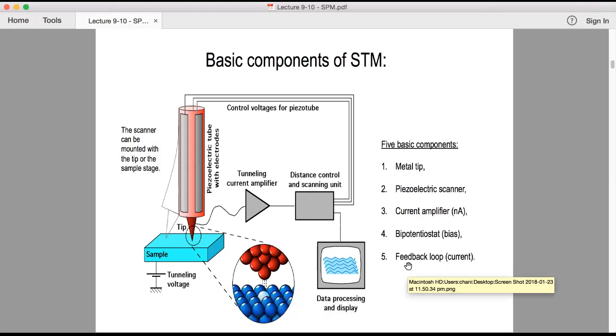The scanning probe microscope has a sharp probe tip on the end of a cantilever, which can scan the surface of the specimen. The tip moves back and forth in a very controlled manner, and it is possible to move the probe atom by atom. Force deflects the cantilever when the tip gets closer to the surface of the sample, and it can be measured by a laser reflected from the cantilever into photodiodes.